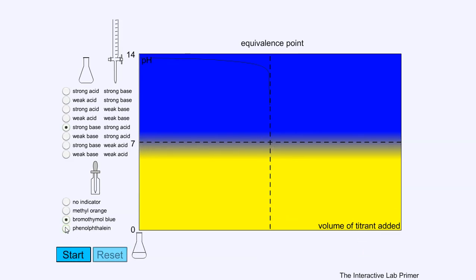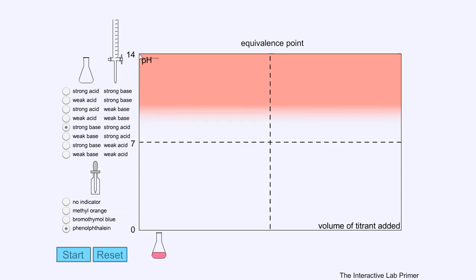so that was ideal. If I do phenolphthalein, again that high pH, have a look to see when this changes to colorless. Does it change at round about a pH of 7? And we go there, it is so close, it is still feasible to use this.